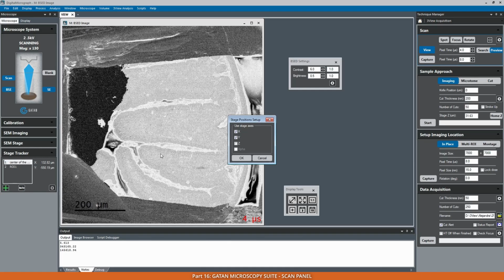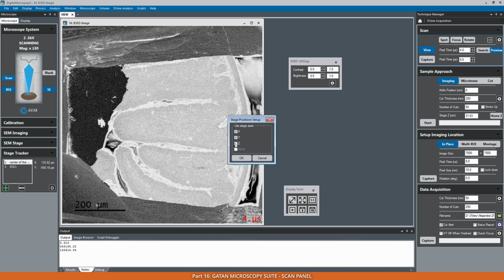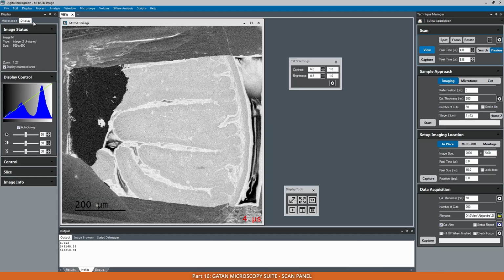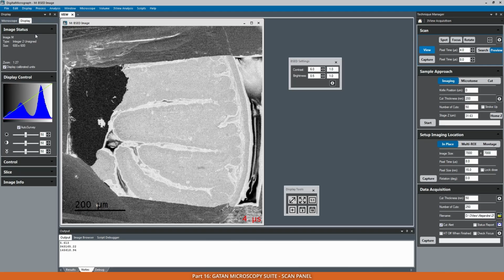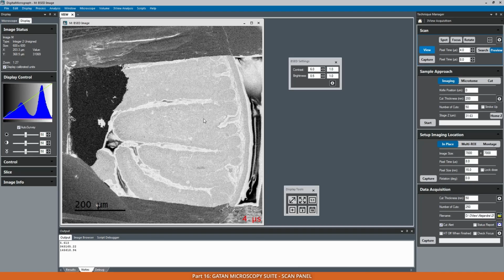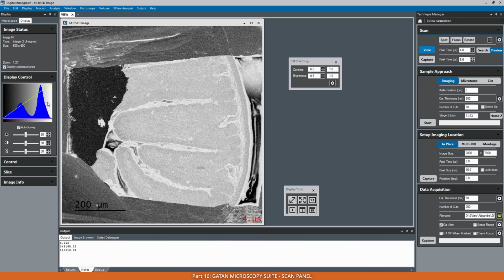There are some settings, and the settings basically allow you to define which of the parameters you want to tweak. Typically you just want to go, of course, X, Y, do not go to these two. In addition, there is a second tab here which is called display, and in display you see the histogram of the current signal, and then it's automatically calculated.